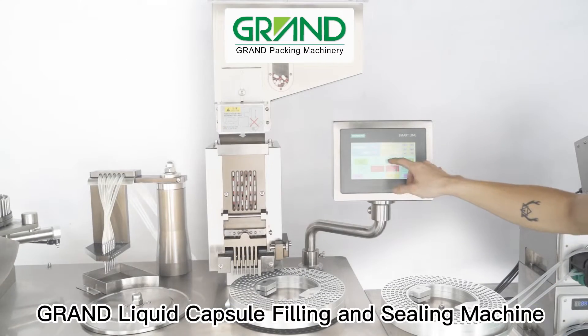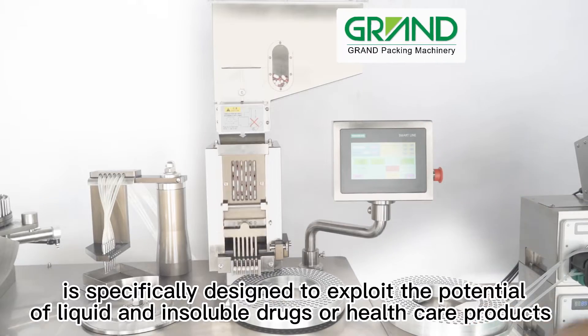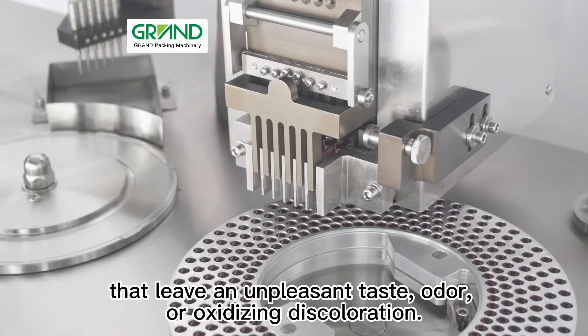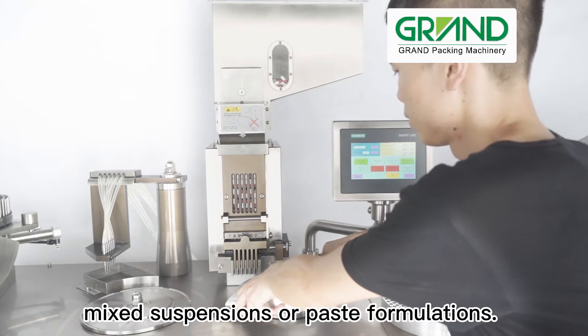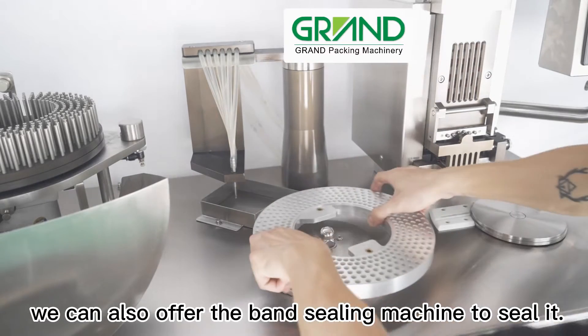Grand liquid capsule filling and sealing machine is specifically designed to exploit the potential of liquid and insoluble drugs or healthcare products that leave an unpleasant taste, odor, or oxidizing discoloration. It is a semi-automatic, GMP-compliant machine that fills with oily liquid solution, mixed suspensions, or paste formulations. Besides, we can also offer the band sealing machine to seal it.